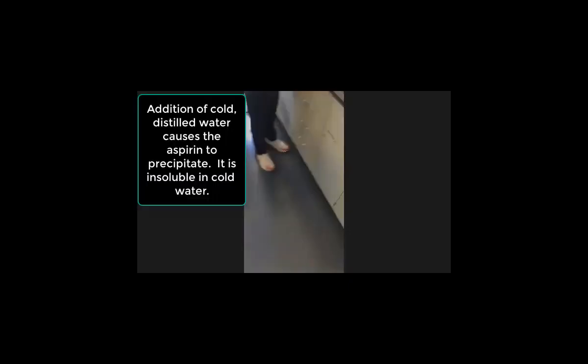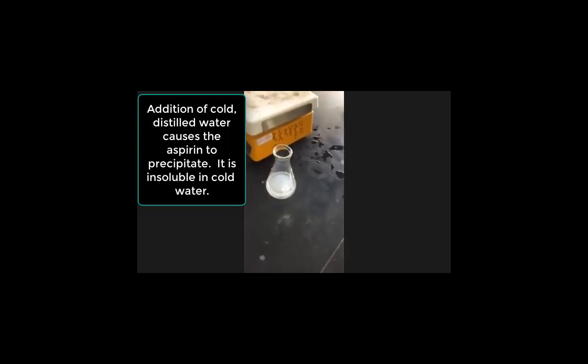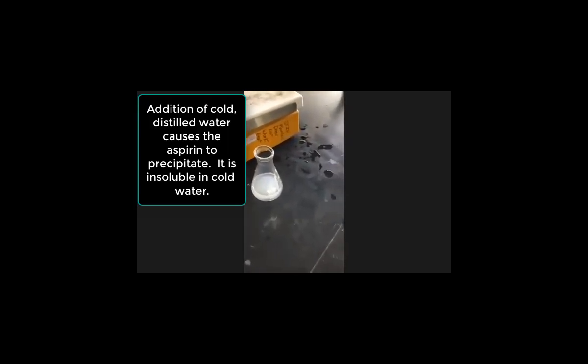Like if it calls for cold water, what you can do is, boom, you can just take the base off the graduated cylinder and stick it down into a cooler or an ice bath or whatever you want to do. Omari added water to his and it immediately turned cloudy. What the water does, see, aspirin is not soluble in water.